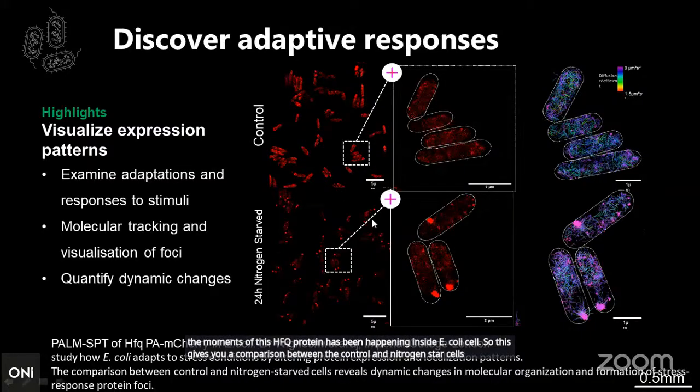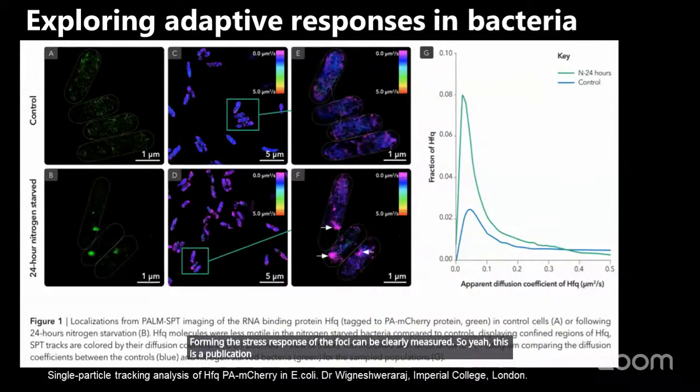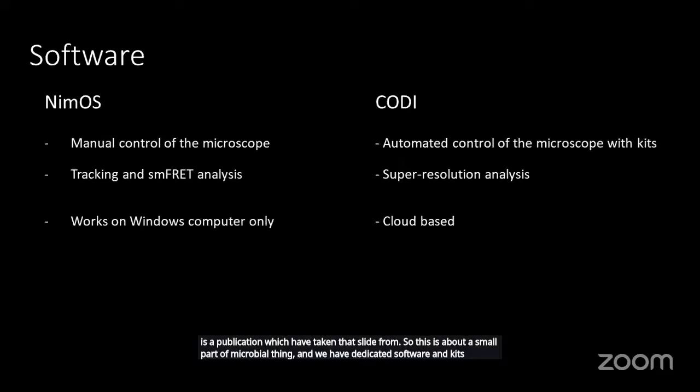So this is your control and 24 hours nitrogen starved cells. You can see the real dynamic changes in molecular organizations and the formation of stress response foci can be clearly measured. So yeah, this is a publication which I've taken that slide from. This is about a small part of microbial work, and we have dedicated software and kits. I just wanted to run through this.